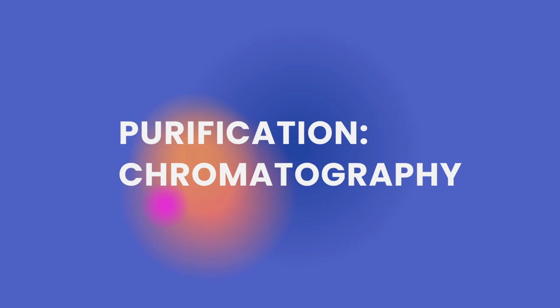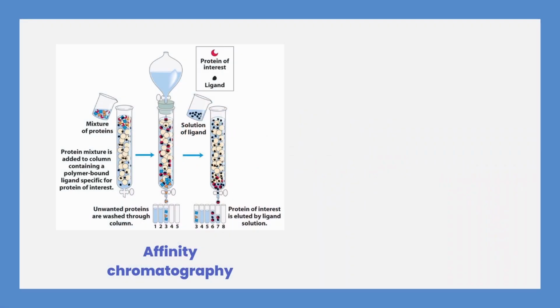In this process, the lysate is purified to obtain highly concentrated and pure Cry1Ac proteins by various chromatographic techniques, such as affinity chromatography, which uses the unique binding property of the target molecule to a specific ligand.